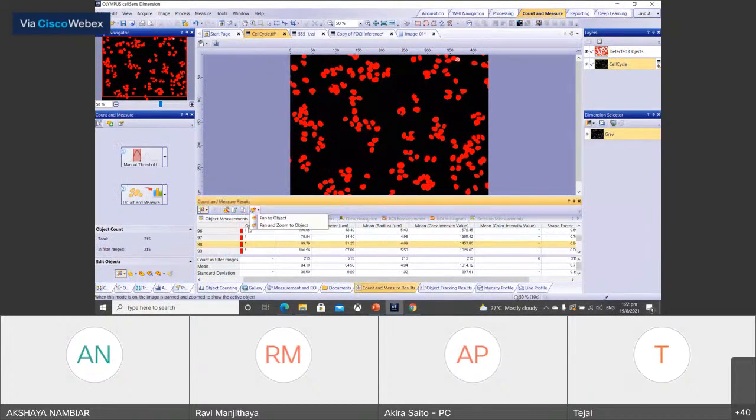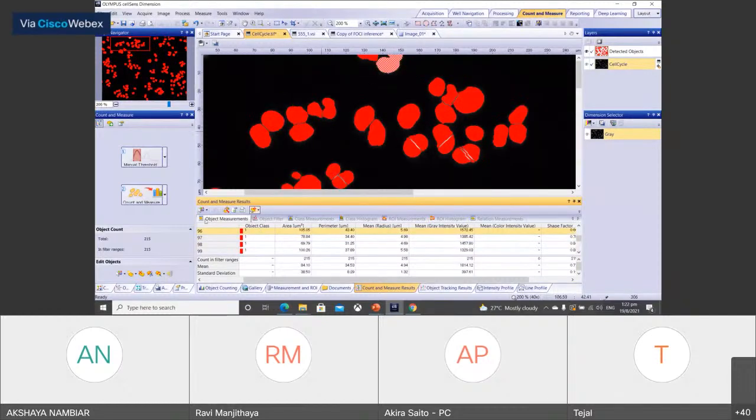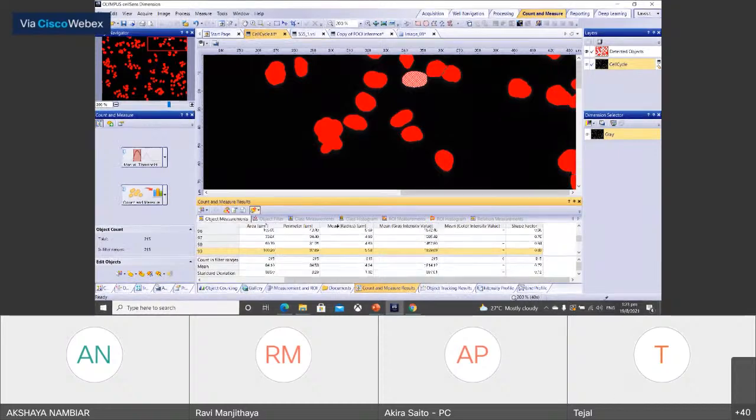So for example, okay, object on zoom. Sorry. Plan and zoom. So this one is this one, and this one is this one. This one is this one. So you can get some kind of morphology information and also the intensity information.